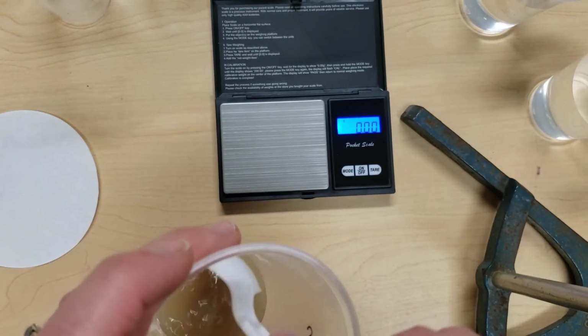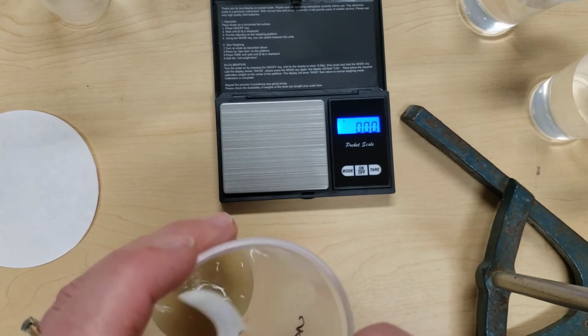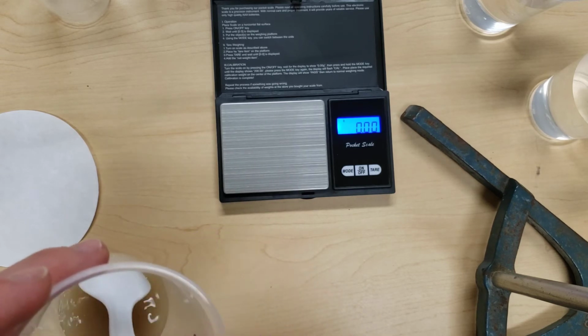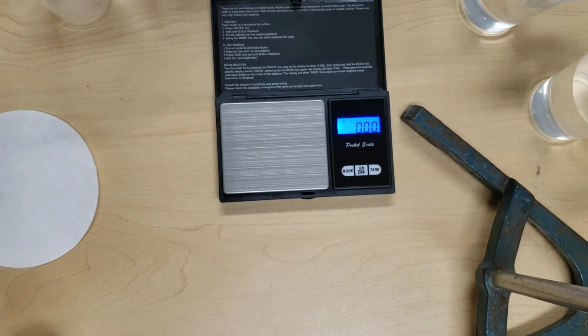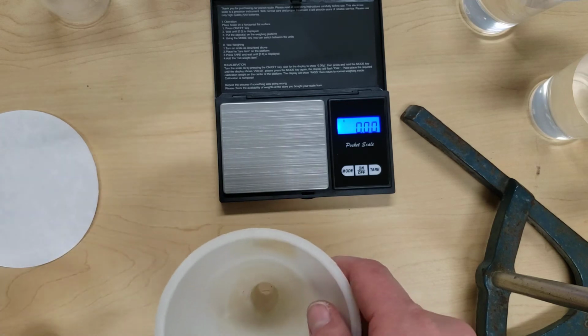We're going to dissolve the salt into the water. The sand is going to be left behind because it does not dissolve. And we're going to filter the salt water away from the sand. So you want to mix that for 2 minutes. So we're going to take our second container that we weighed. We're going to put our funnel in it.